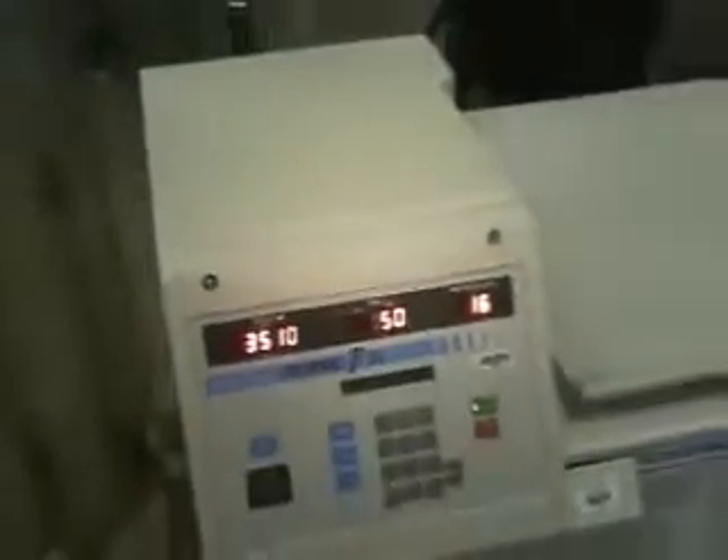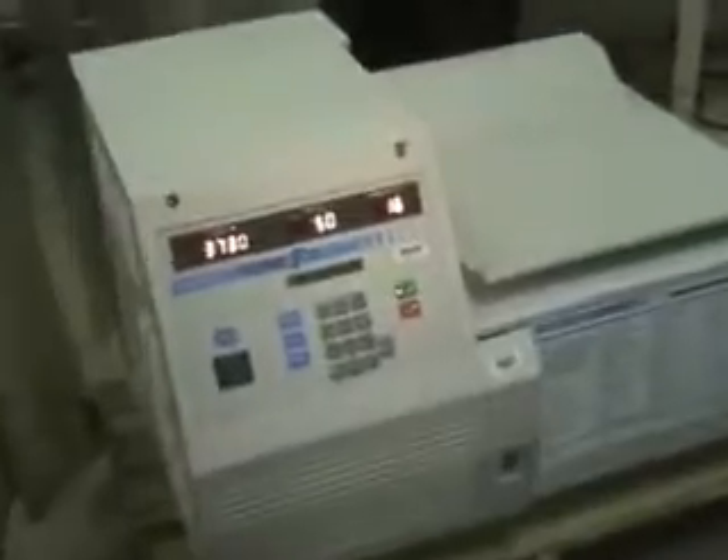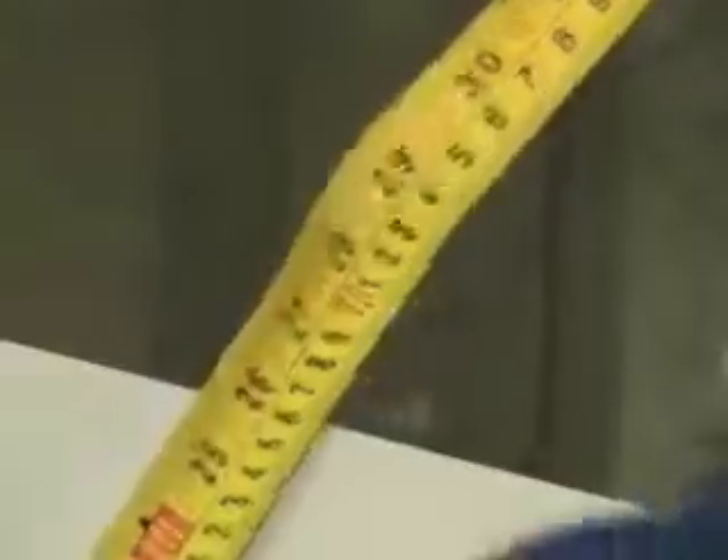And that's getting up to speed. Dimensions of the unit: I would safely say it's 24 inches high, 36 inches in length, and front to back, safely 30 inches. Should fit on a bench top if the bench is not less than 30 inches.